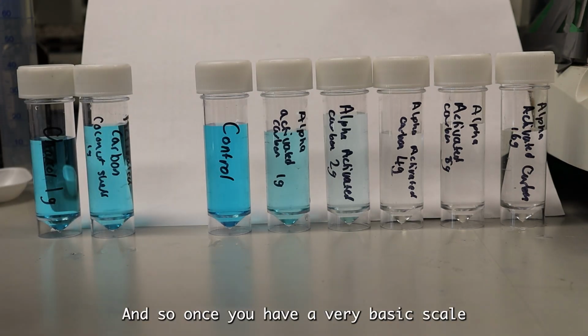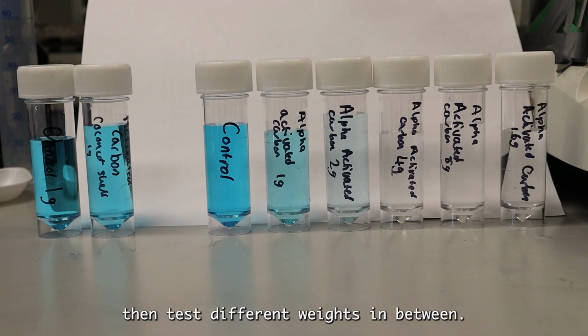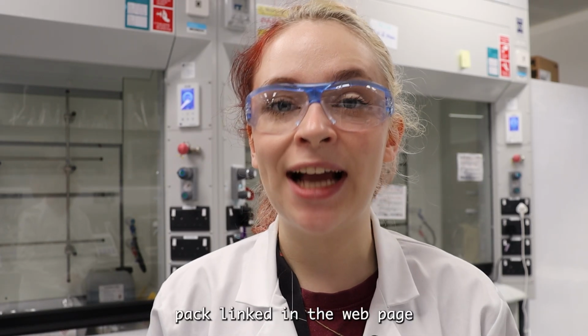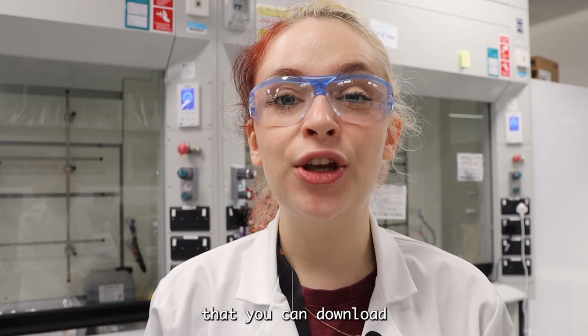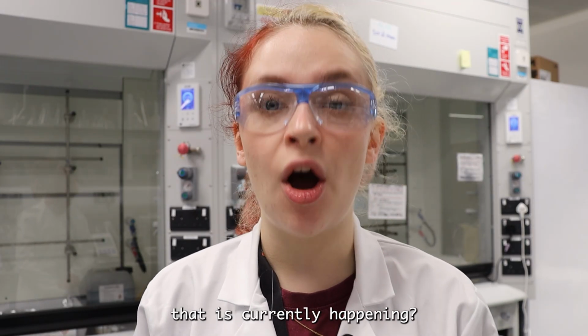And so once you have a very basic scale like this, you can then test different weights in between, which you can then use to create a beautiful graph. There are a set of questions on the activity pack linked in the ChemBAM webpage that you can download and complete at this point. So how does this relate to research that is currently happening?